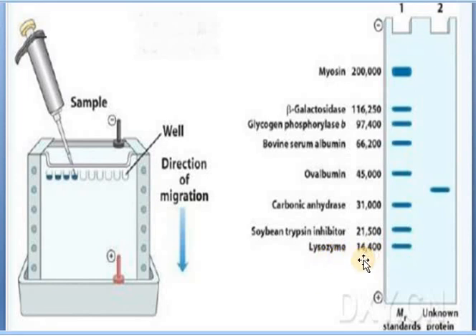lysozyme, just 14,400 Dalton, will have the least molecular weight and migrate to the bottom. So according to the molecular weight we will see the layering of proteins in the gel. So it is called a molecular weight ladder, just like a ladder arrangement.